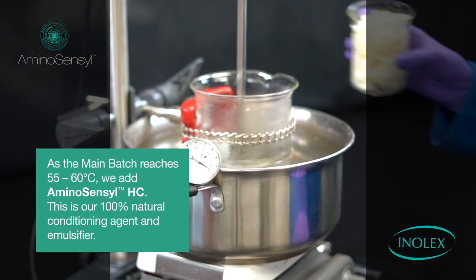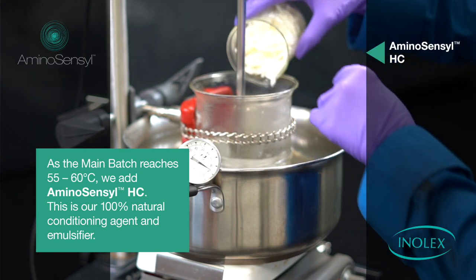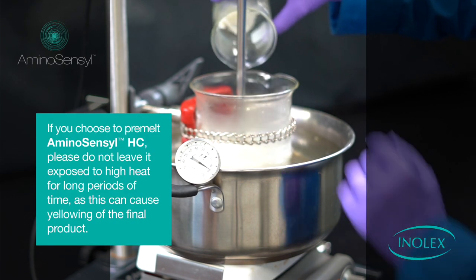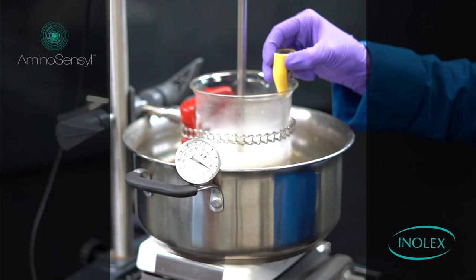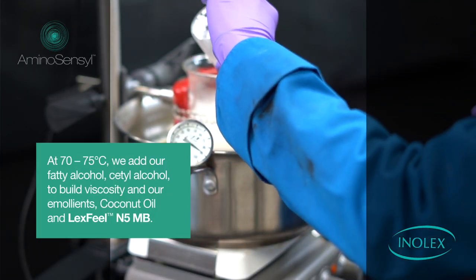As the main batch reaches 55 to 60 degrees Celsius, we add Aminosensil HC — our 100% natural conditioning agent and emulsifier. If you choose to pre-melt Aminosensil HC before addition, please do not leave it at high melt temperature for a long period of time, as it can cause yellowing of the final product.